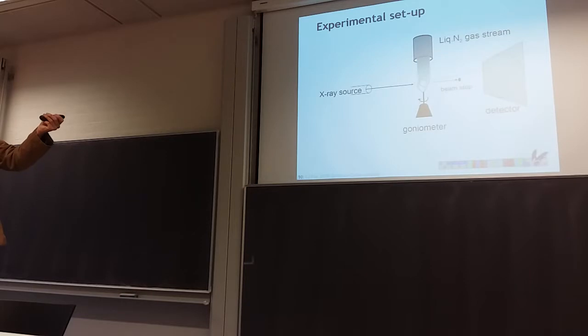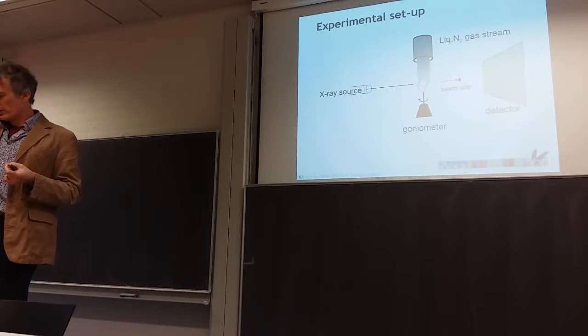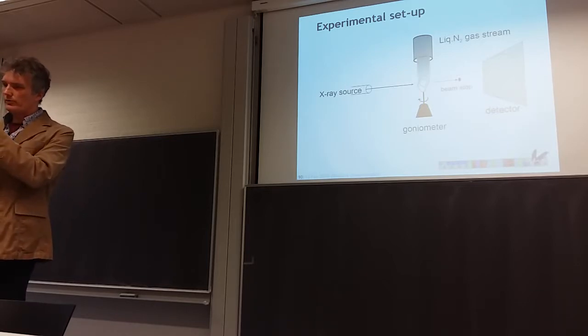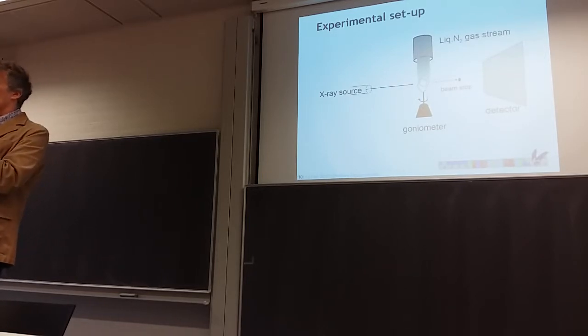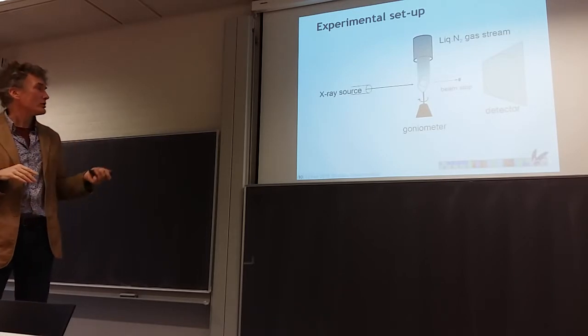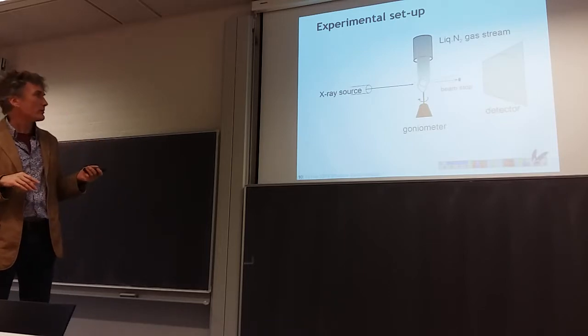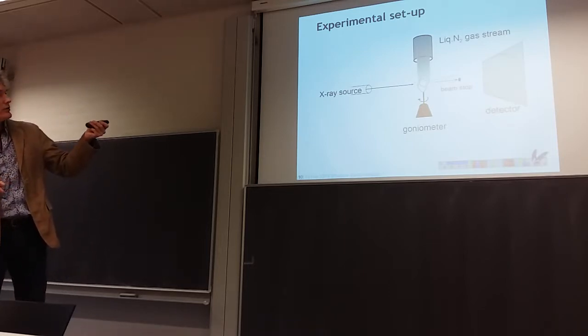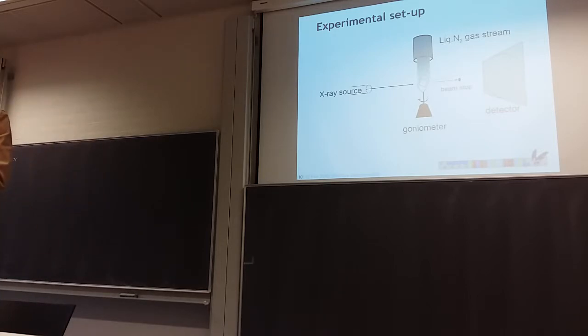The fourth thing is the goniometer, because you need exposure of your crystal from different angles, but you need to know exactly which angles they are. So you rotate it in different directions. That's a very cool apparatus that does that reproducibly. And finally, you have the detector over here. That used to be a photographic plate, but nowadays it's a very high resolution CCD camera.